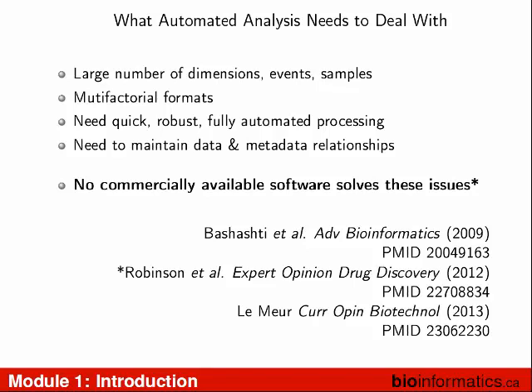The biggest problem, and this is the one thing I hope you remember out of this two-day session, is that if you're going to do automated analysis, the more effort you can spend on making sure everything is annotated as best you can, the easier your whole life will be. Because you're going to be parsing in all this data, and you'll be reading in these headers. And what you don't want to be doing, after you've automated all this analysis, is sitting there trying to tweak all this metadata one by one by one by one. You're not winning at that point.